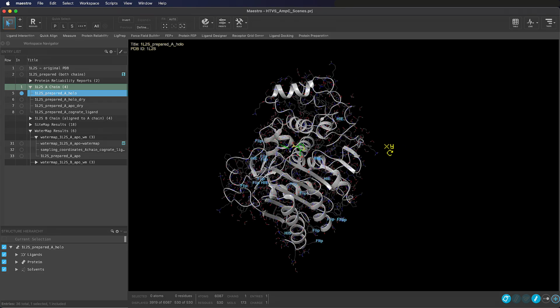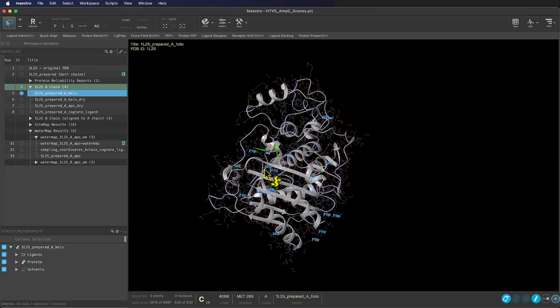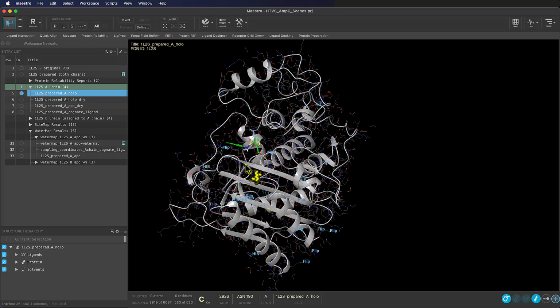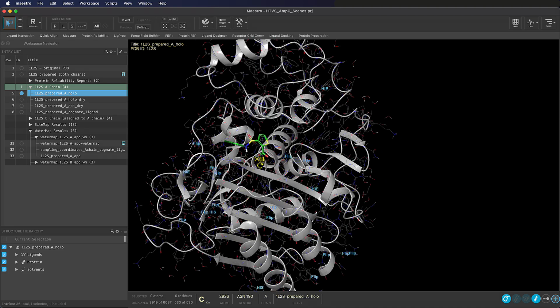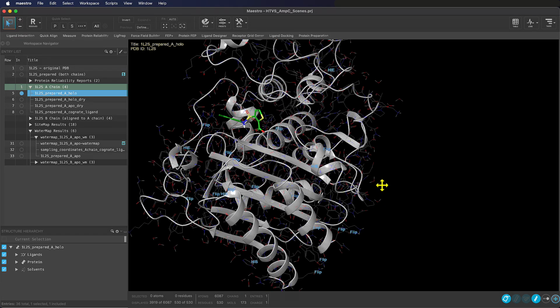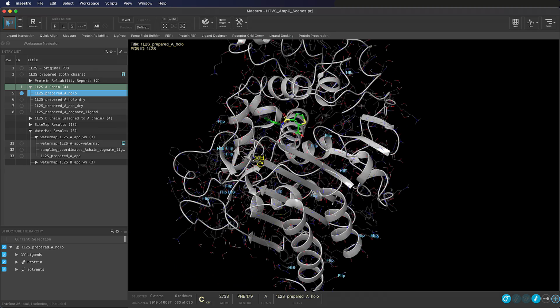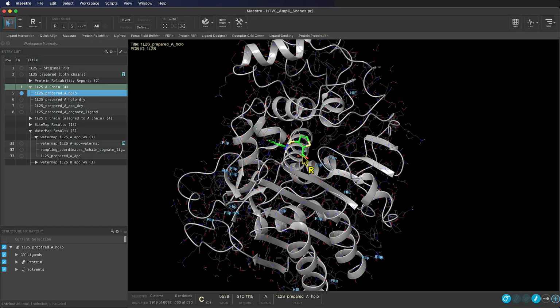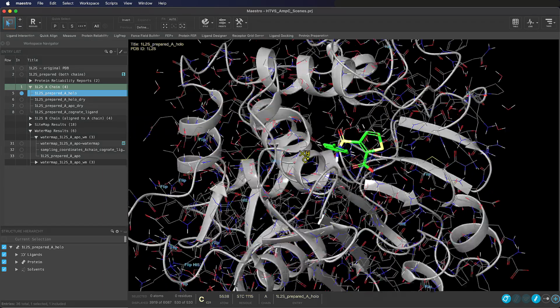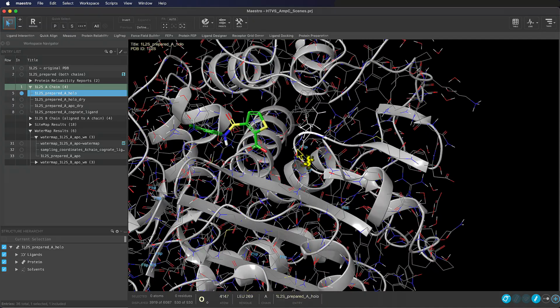and states have been assigned depending on the net charge and the location of protons. Some residues, such as histidine, can adopt multiple states. With histidine, we may see HIP, which is +1, both delta and epsilon nitrogens protonated, HID, neutral, delta nitrogen protonated, and HIE, neutral, epsilon nitrogen protonated, whereas the default is HIS. In Maestro, any state changes or flips that have occurred during the protein preparation process will be labelled, for example HIE, HID, or flip.